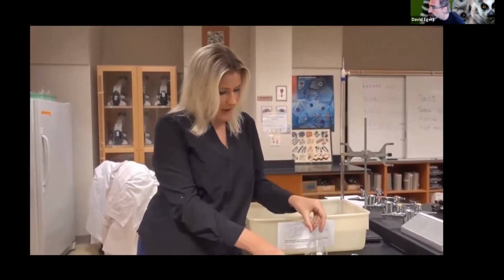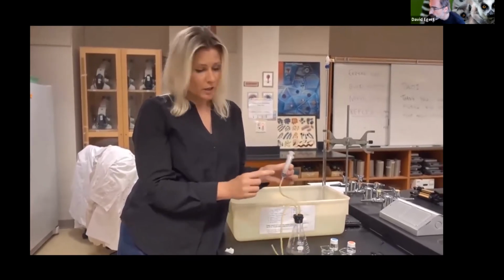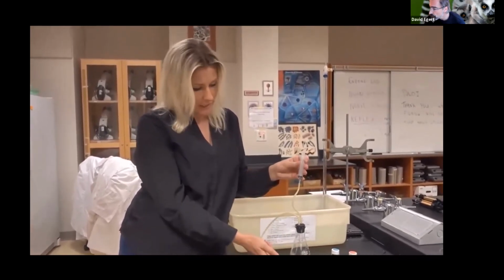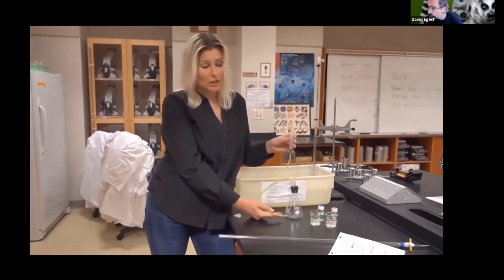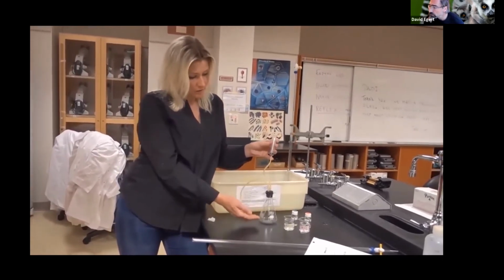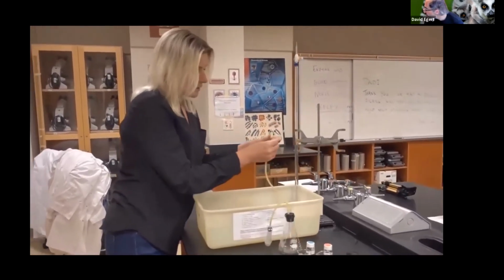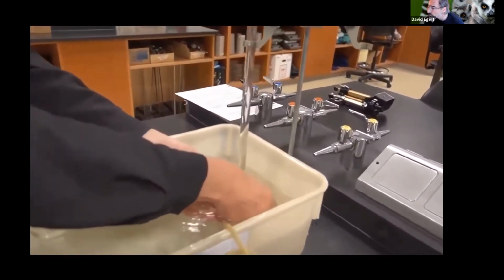So once we're done with that, we're going to seal this tightly. You have your trial dilution ready made in this. Then once you squirt the hydrogen peroxide down, the catalase will help out with that reaction that is going to lead to water and oxygen. And the oxygen is a gas, which is of course going to want to escape and bubble out of this tube. So we're going to immerse this before we start the experiment and stick it up into the burette.